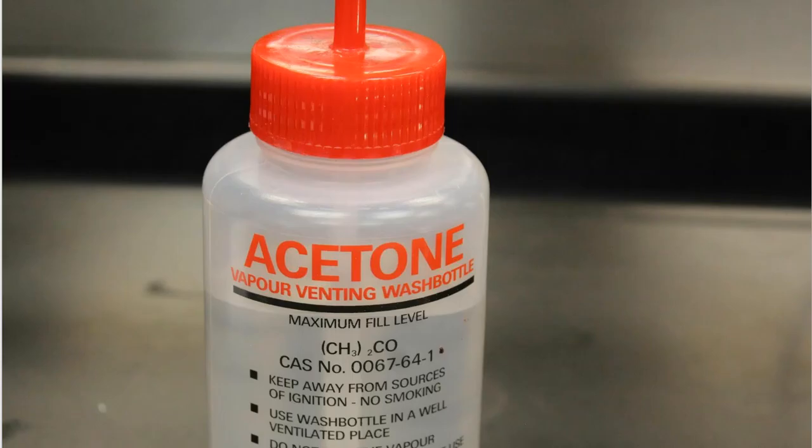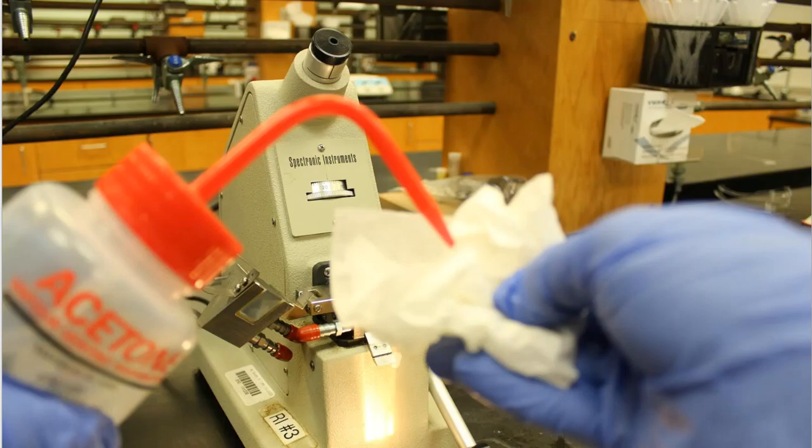So I'm going to take a wad of chem wipes. I'm going to take some of our acetone that we have in our laboratory in a nice convenient squirt bottle, squirt some acetone onto the chem wipes, and then wipe down the prism, so that it's ready for the next person that needs to use it. All right, so there's the story with refractive index, and I'm sticking to it, and I'll tell you a little bit more about what we need to do with that refractive index value at the end of this presentation. All right, so there's test number 1 now finished.